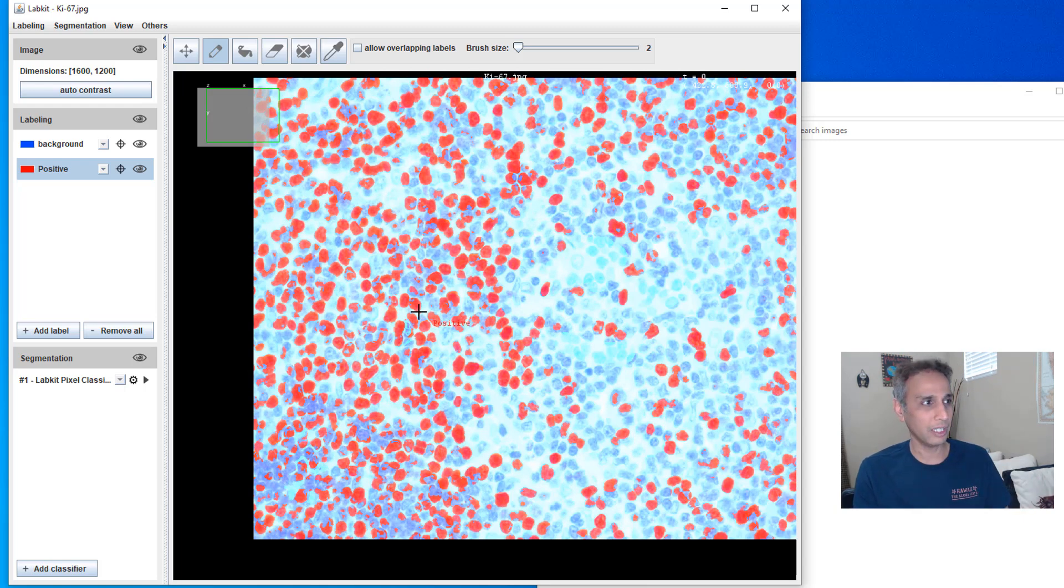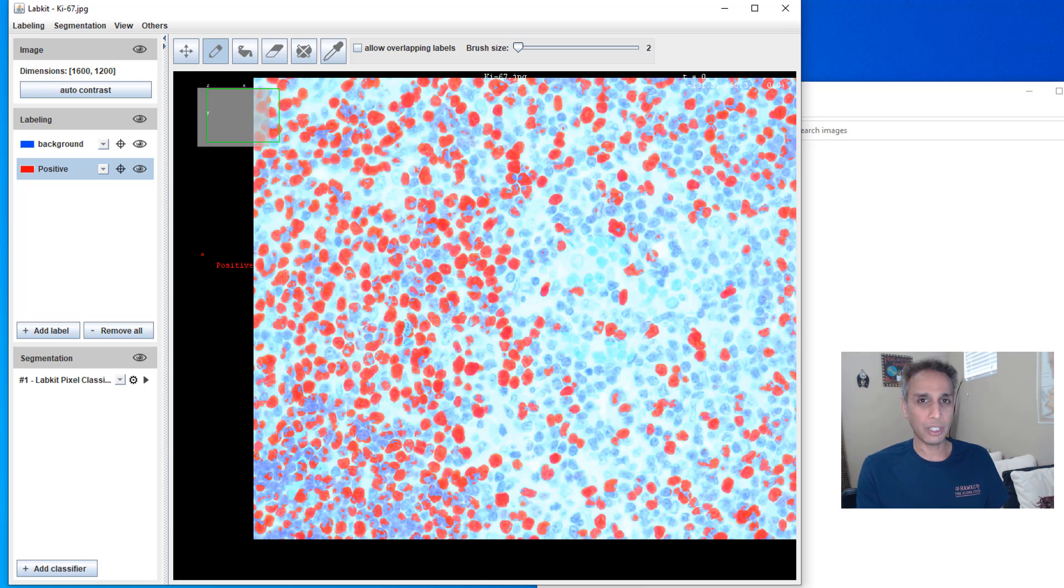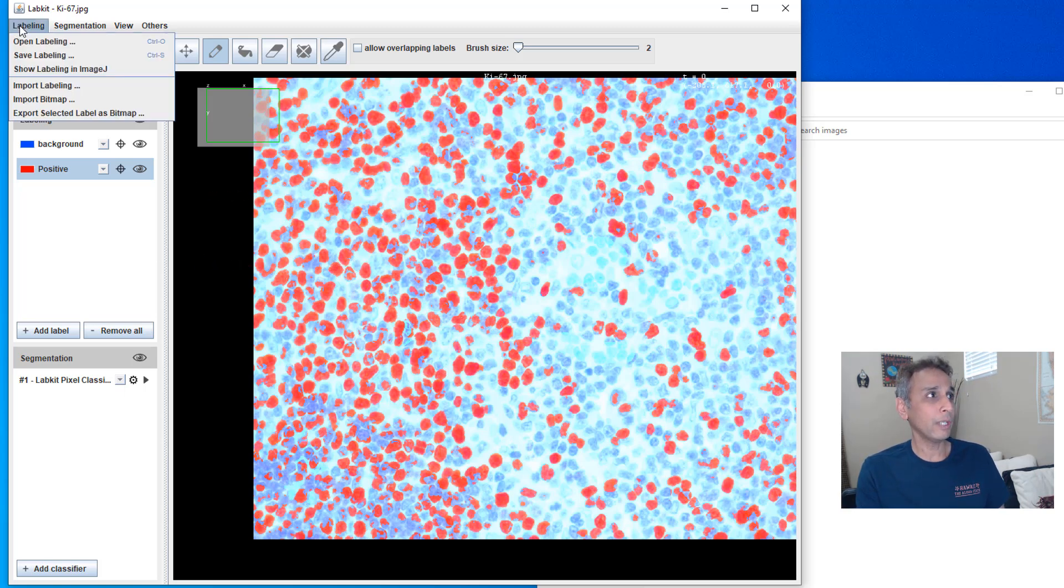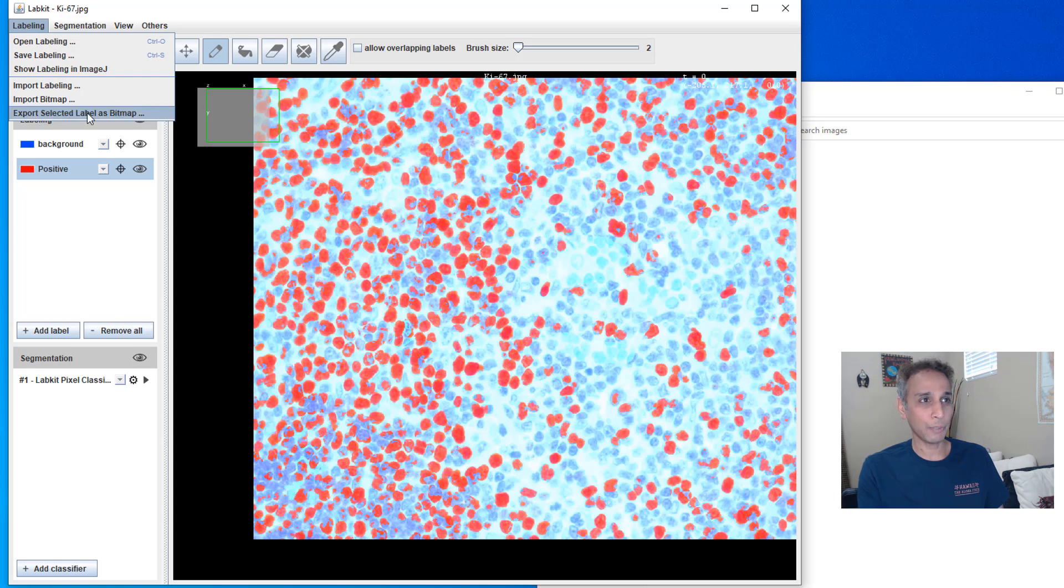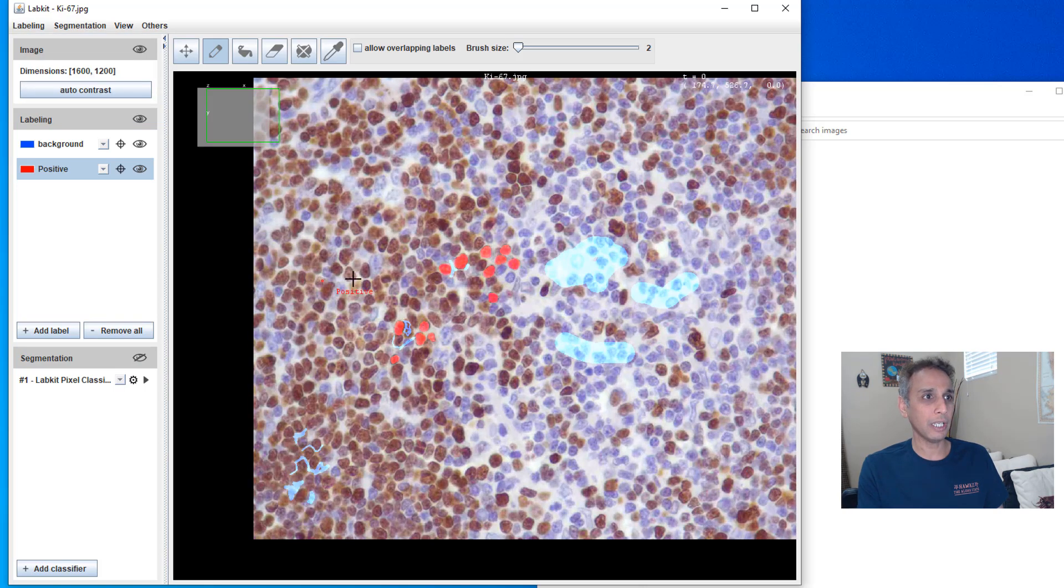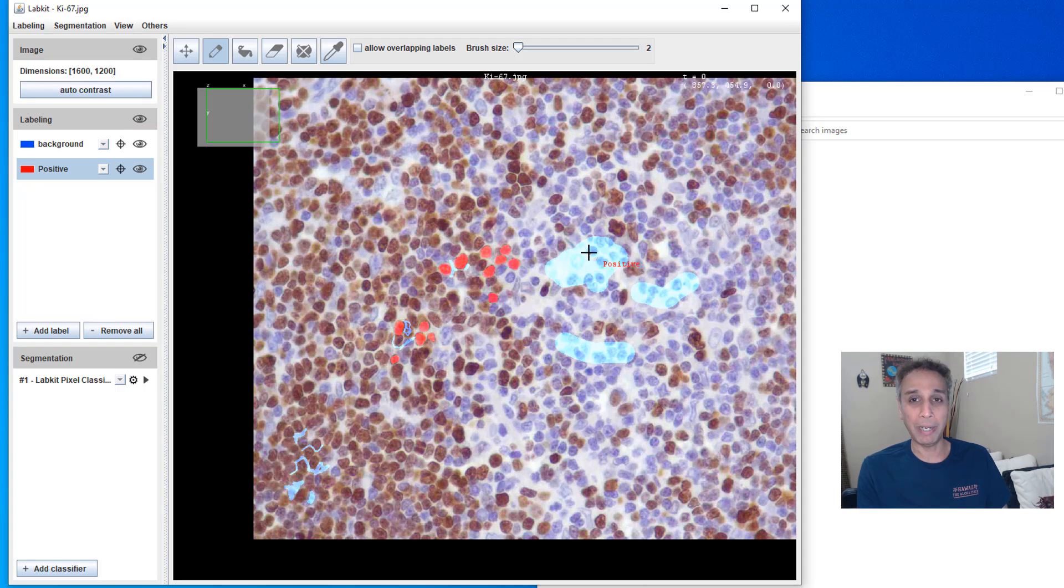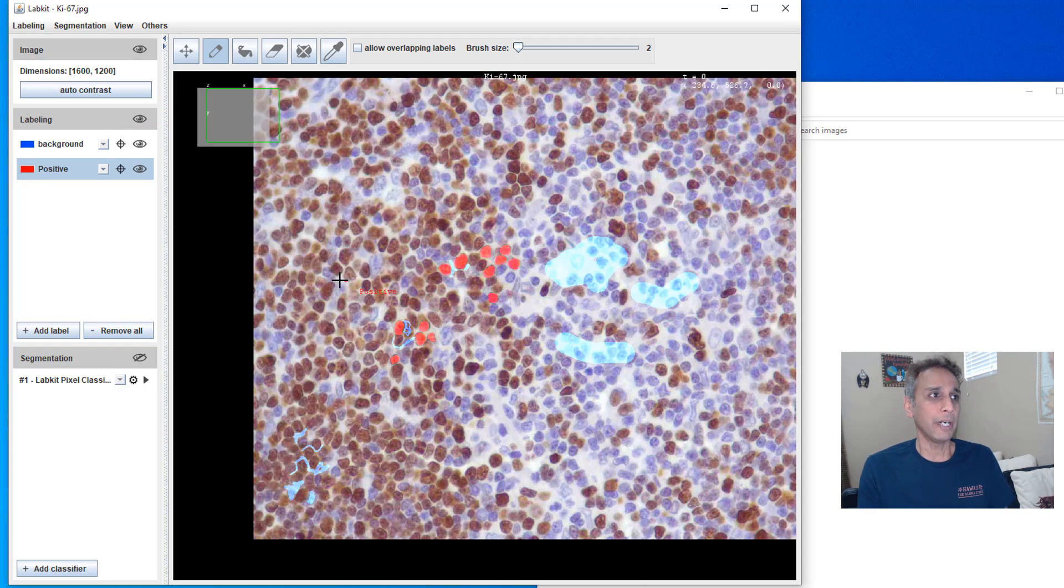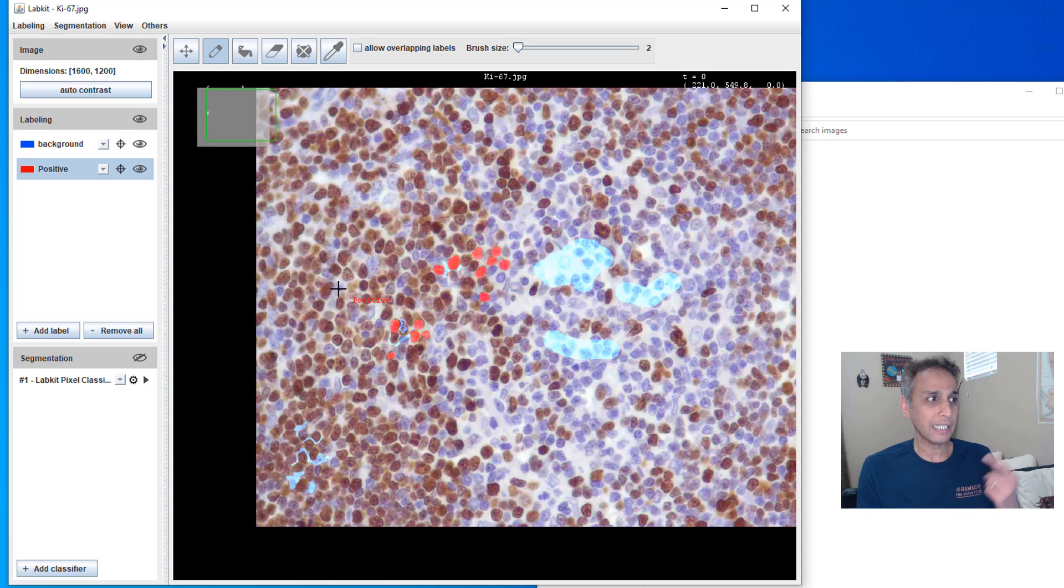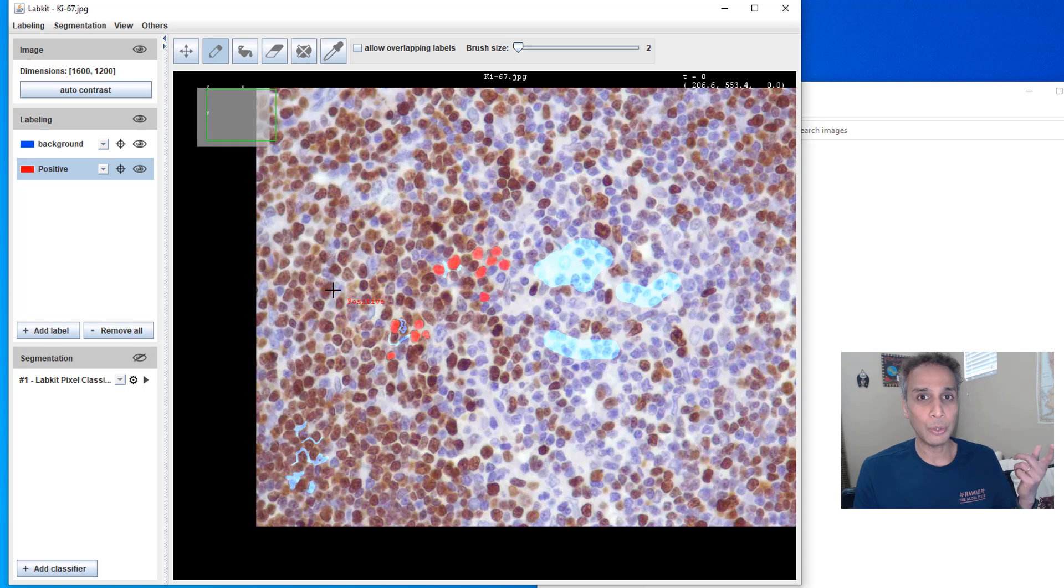And once you are done with this, what to do? And if you just go ahead and do labeling, export selected labels as bitmap, it's going to export only the labels that I have done as bitmap, right? Maybe that's what you want.